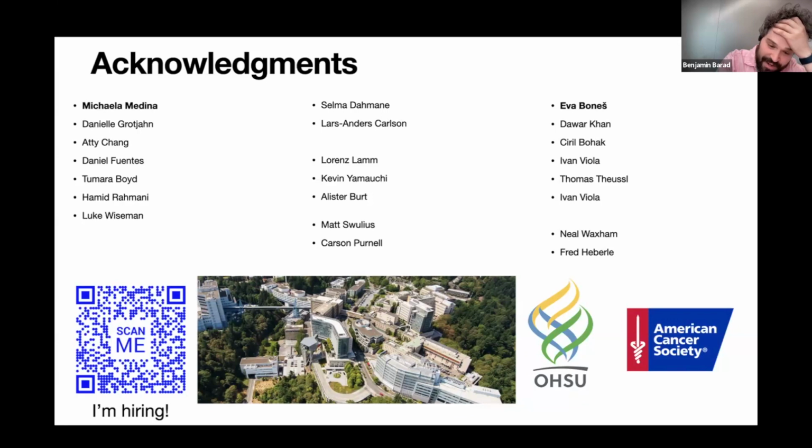One possibility might be to just redo all of the measurements on the vertices and just push the vertices, because those are much simpler. The reason to do the face-oriented measurements is it's much better for the ultrastructural analysis and for particle picking, because each face has an area. So I can do area weighting for statistics and say if it's covering a large area, that's more meaningful than one that's covering a small area. But yeah, this is technical nerd stuff, but it is fun.